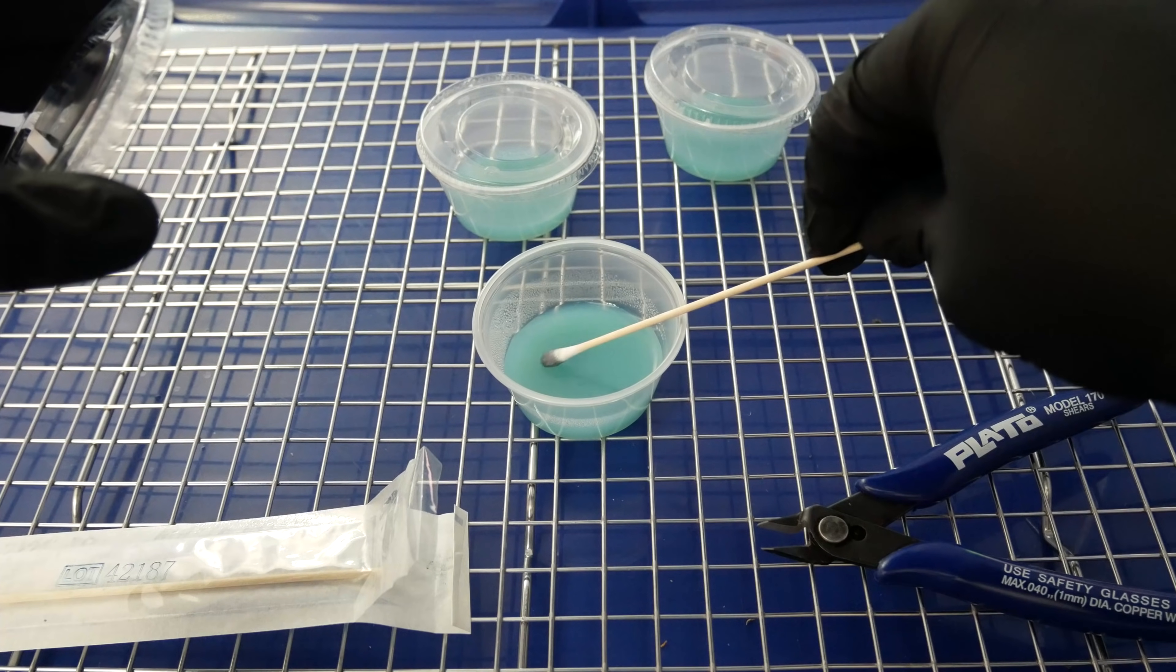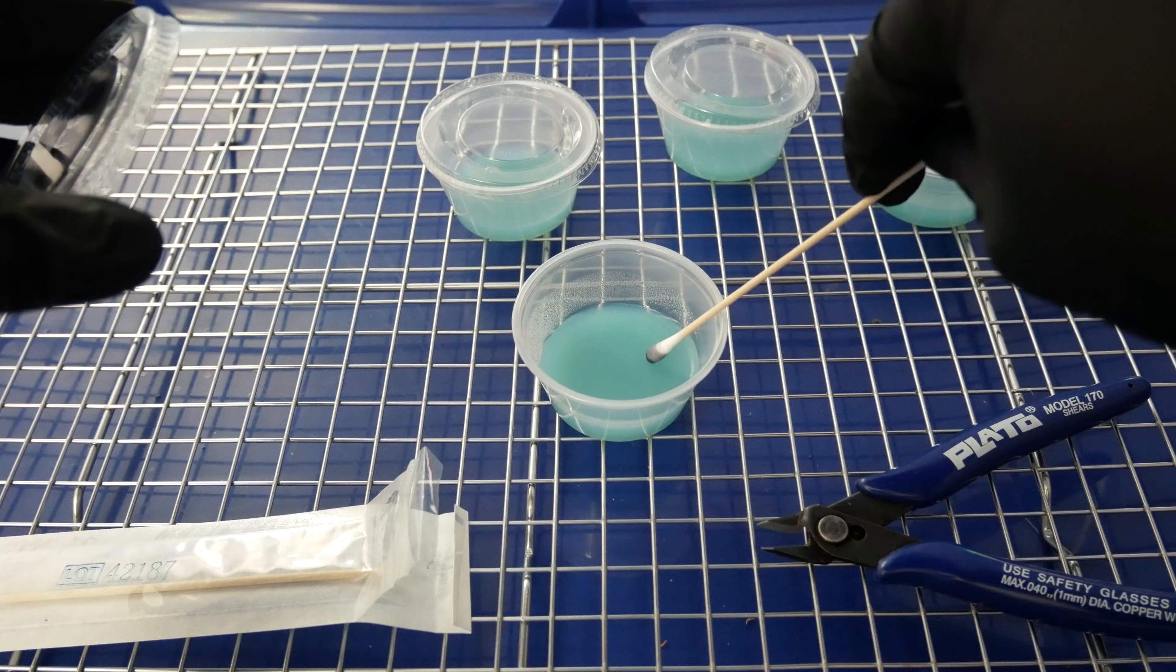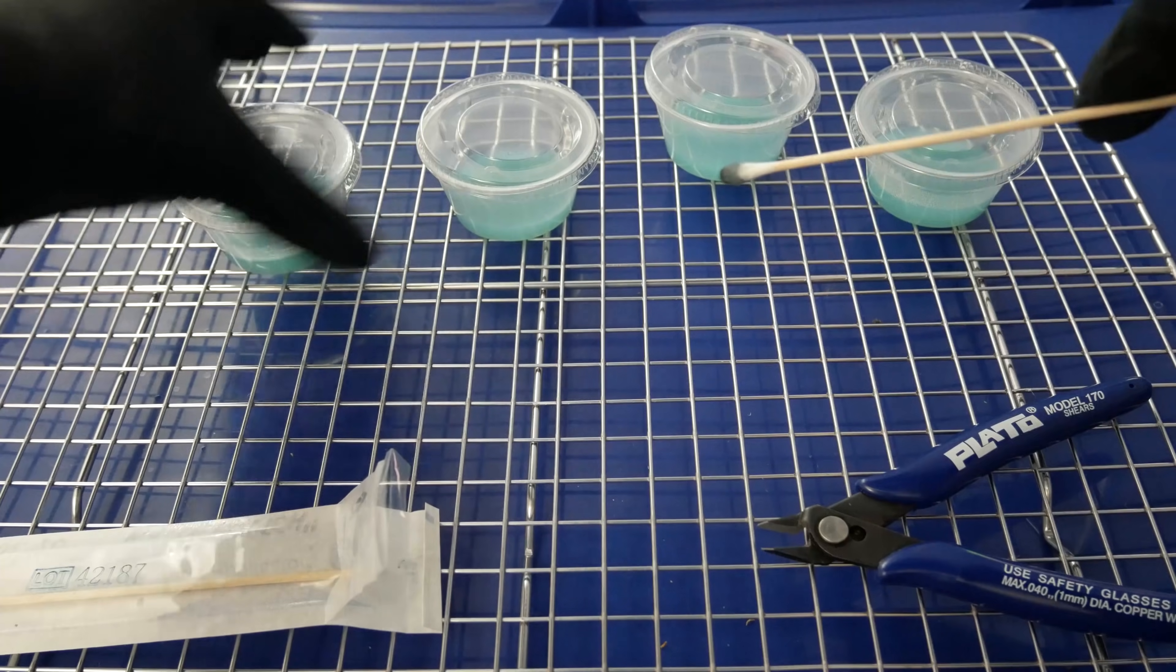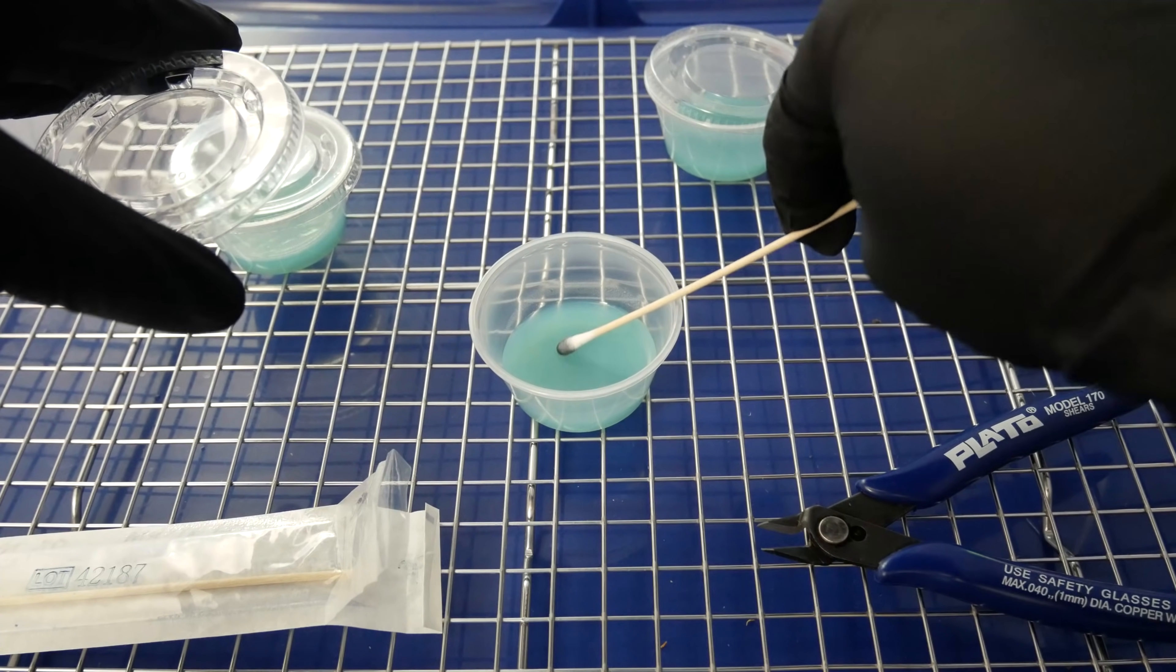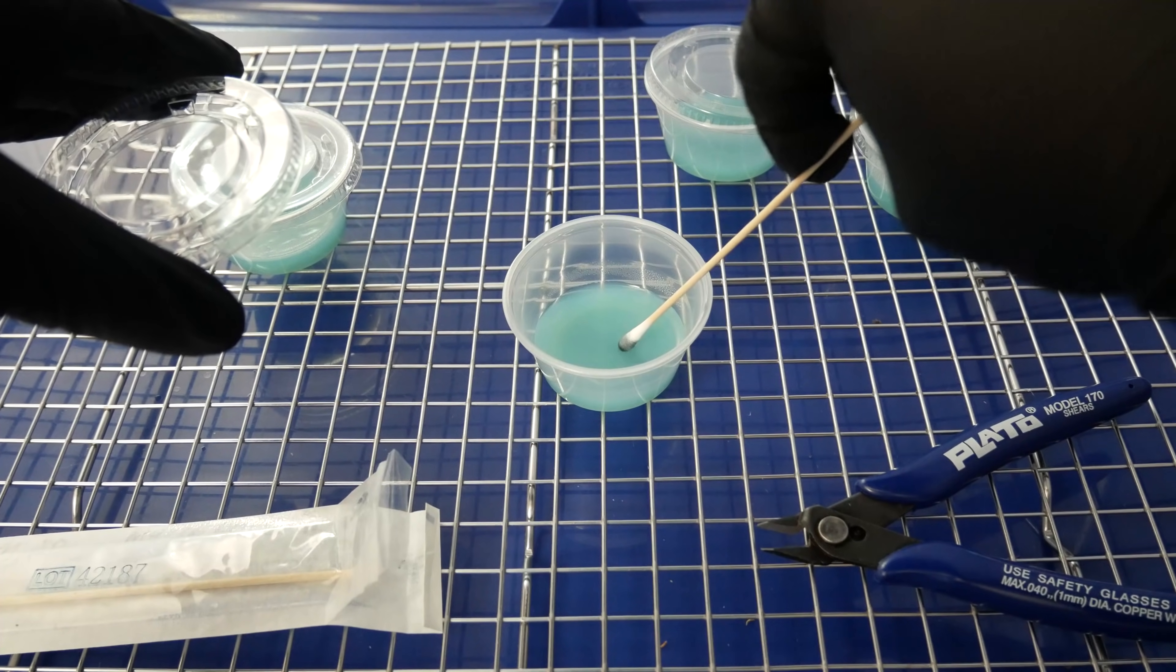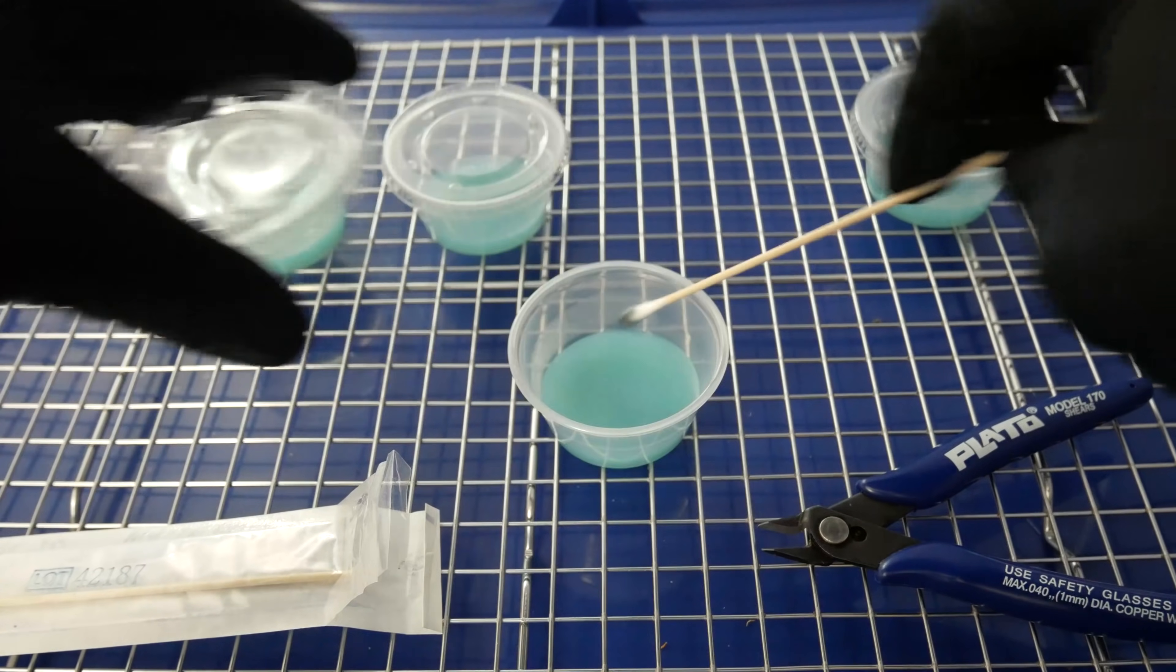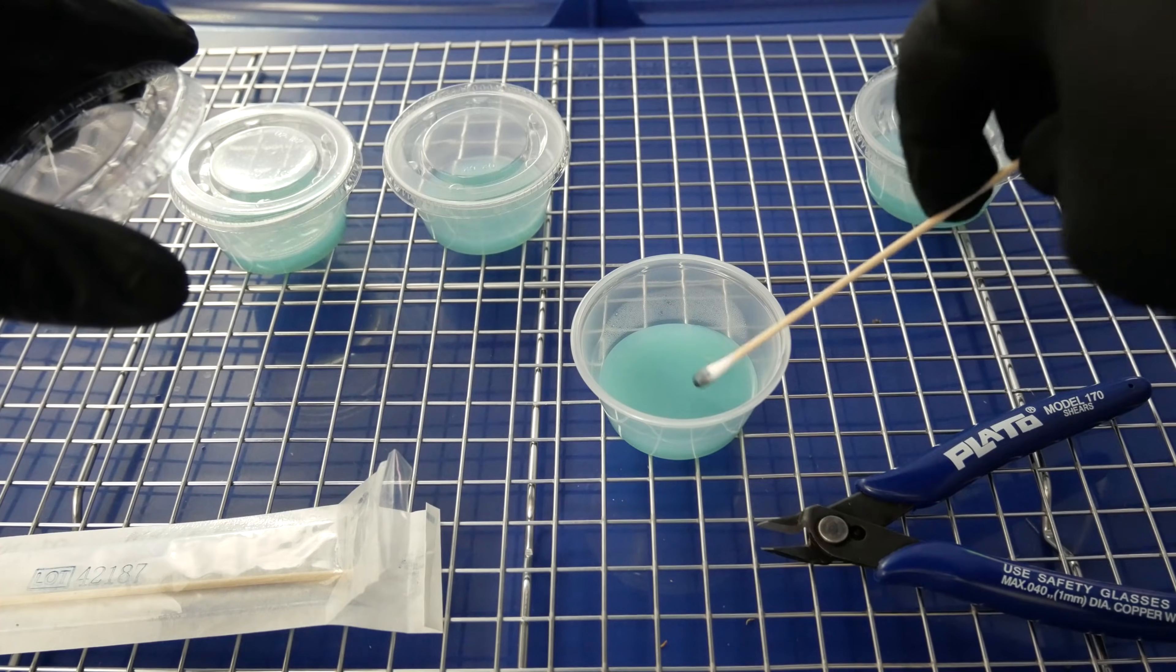And what you want to do is swab the agar with the spore swab. I like doing this little zigzag pattern while twisting the spore swab to get all angles of the swab to make contact with the agar. This will ensure the highest chance that spores are transferring to the agar from the spore swab. So go ahead and repeat this process for a few of my cups here. This will ensure that in case one of them doesn't germinate, at least one or two others probably will.